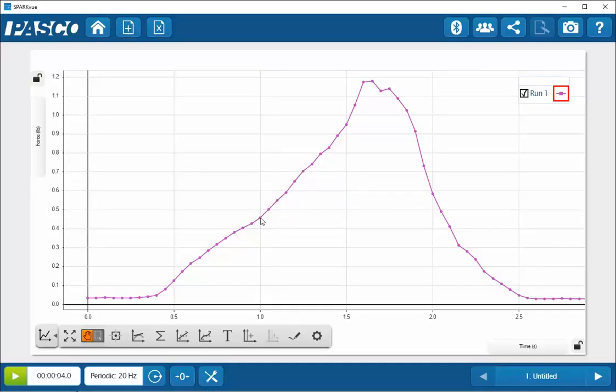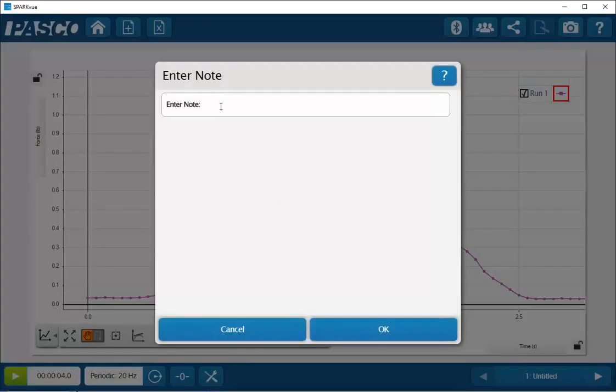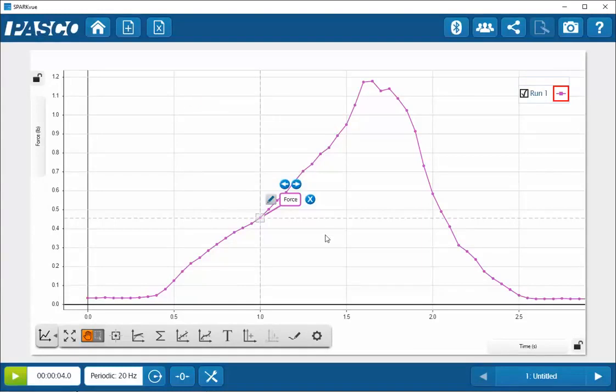The third tool, we can click on the data point, we can select the Annotation tool. With this, we can add information. And click on OK. This can be moved or edited by accessing the tools that are here.